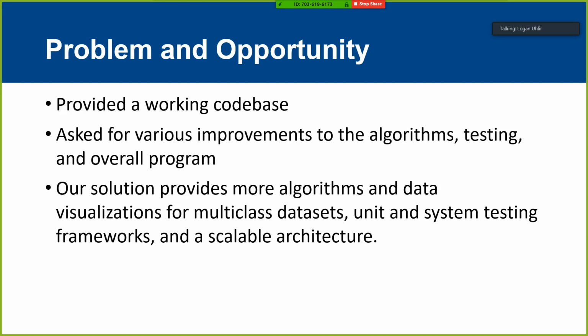So our solution did provide more algorithms and classification techniques that can be used now, and we also made different data visualizations for multi-class data sets. At the beginning of the project, the codebase only worked on binary data sets, so when we moved to multi-class data sets, it was a big shift in the algorithms and the data visualizations that we could use.